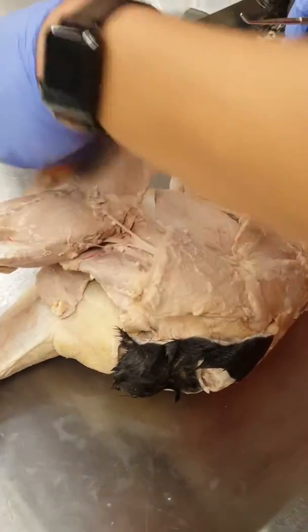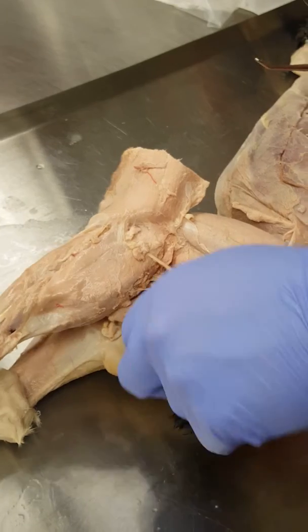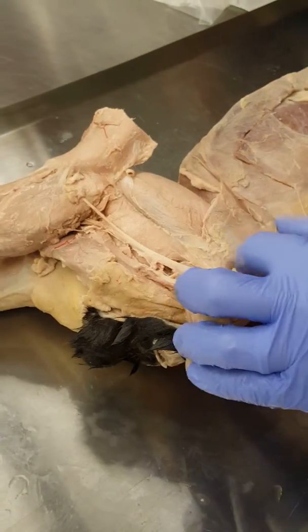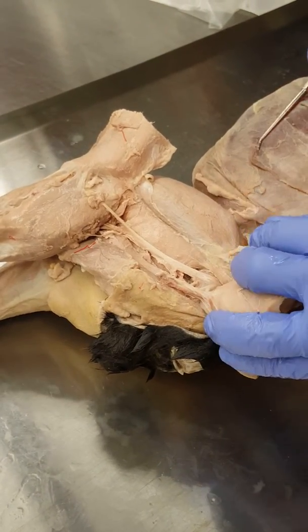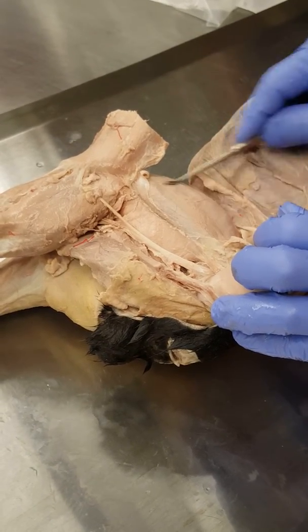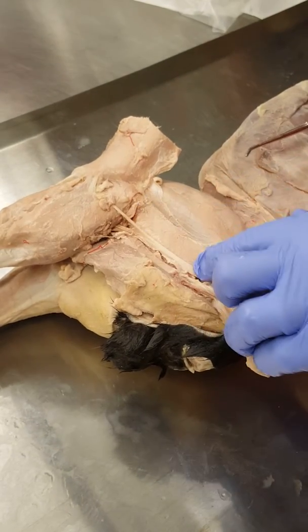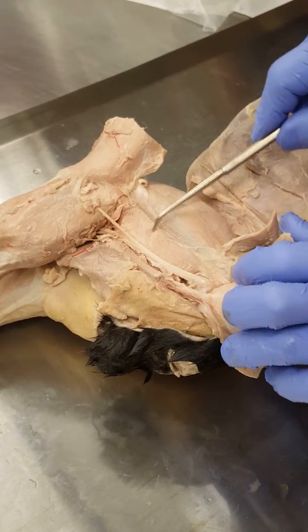And when we go all the way around to the other side, we can actually still see those exact same muscles that we just saw. We start with the vastus lateralis right here, big muscle, part of the quadriceps, and right next to it, this is adductor. It's hard to tell, but this is actually the adductor muscle.